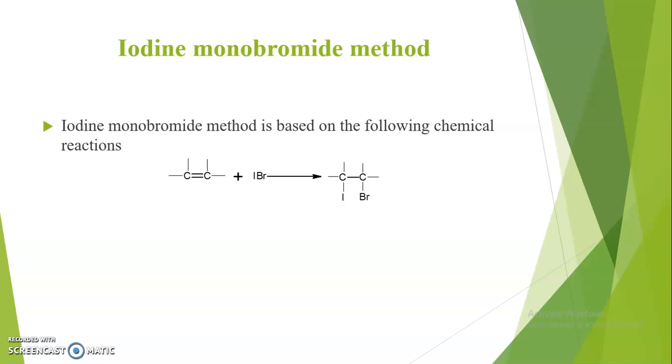Due to the reaction between potassium iodide and our sample, liberation of iodine takes place. If this liberated iodine is reacted with a standard reducing agent like sodium thiosulfate, such titrations are known as iodometry type of titration. All iodometry titrations involve sodium thiosulfate as a reducing agent.